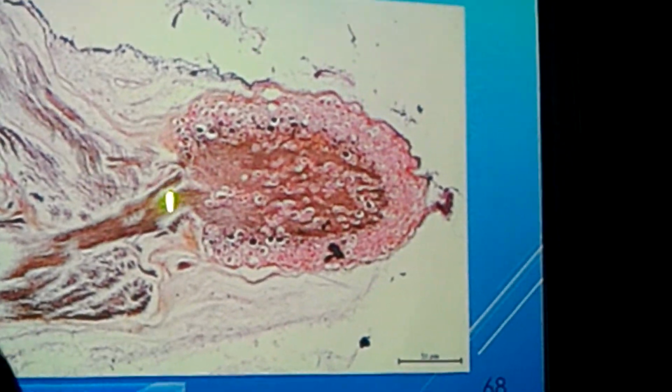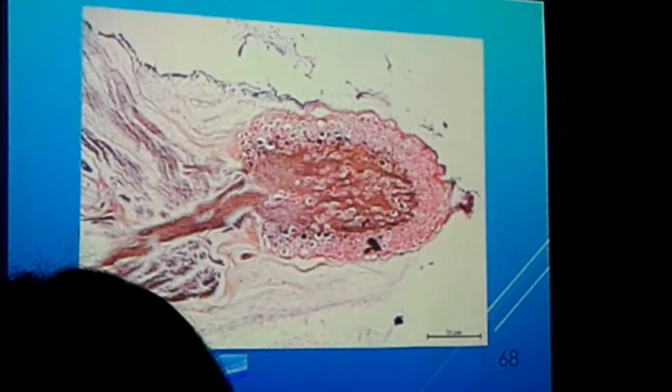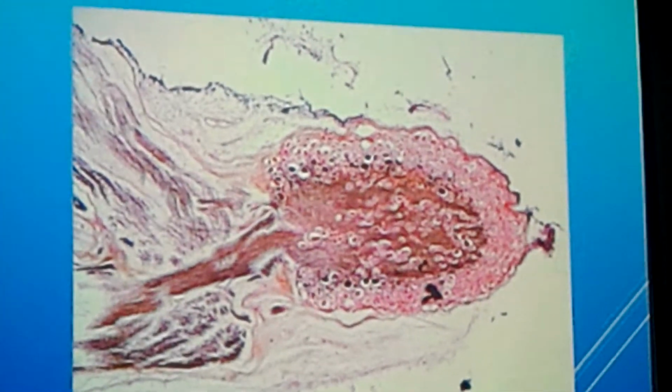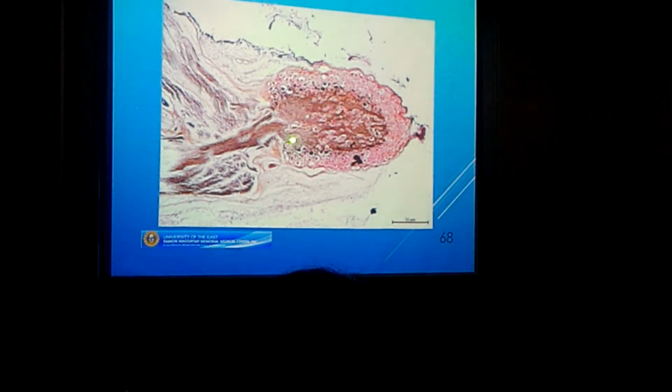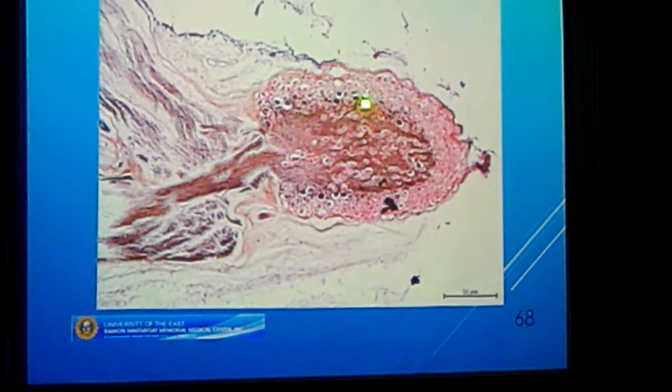Classify the encircled structure. Classify. Classify nervous tissue. Identify. Okay, this is your dorsal root ganglion. Look at the arrangement of your cell bodies and the fibers. Okay, they are clustered. Okay?